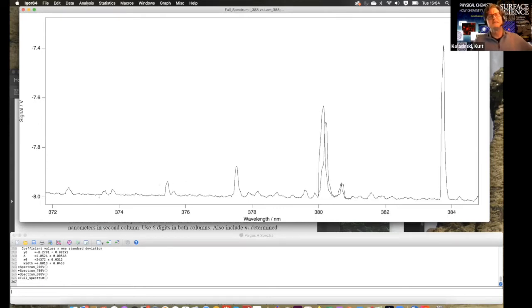And then one of these two, one of those, we might have, well, one thing we can do is we can actually analyze where those peaks were and see whether they fit on the line, because we're going to get a really good line and we could determine which peak was the next one that really fit by, does it follow the pattern? There is a clear pattern in the spectroscopy, and since there's a clear pattern in spectroscopy, we can use that pattern to help us decide which is the next peak.